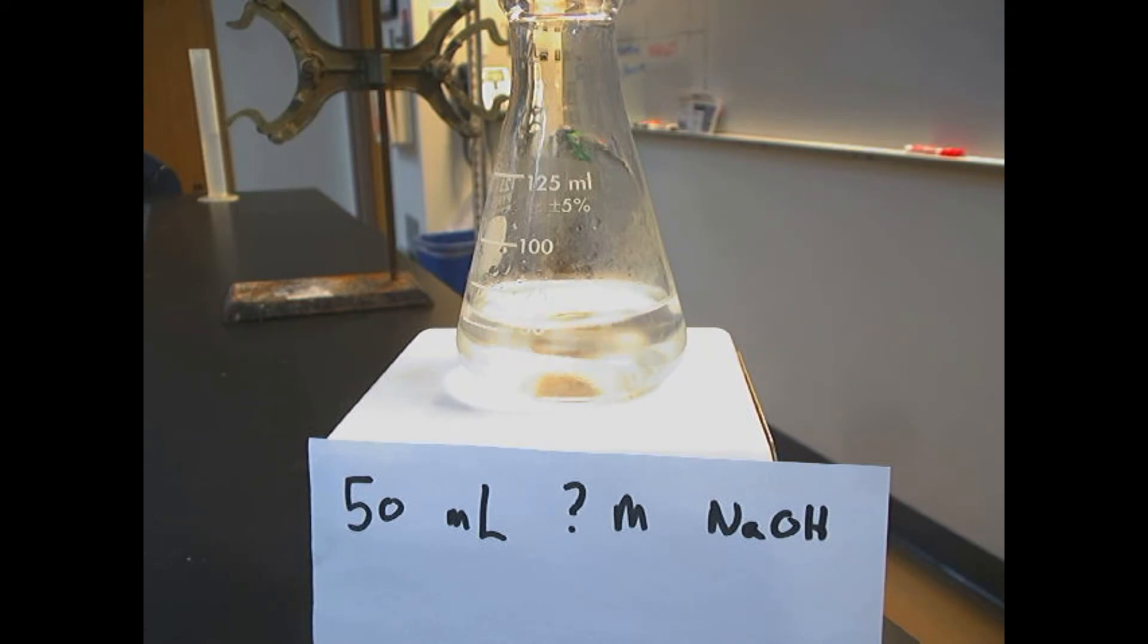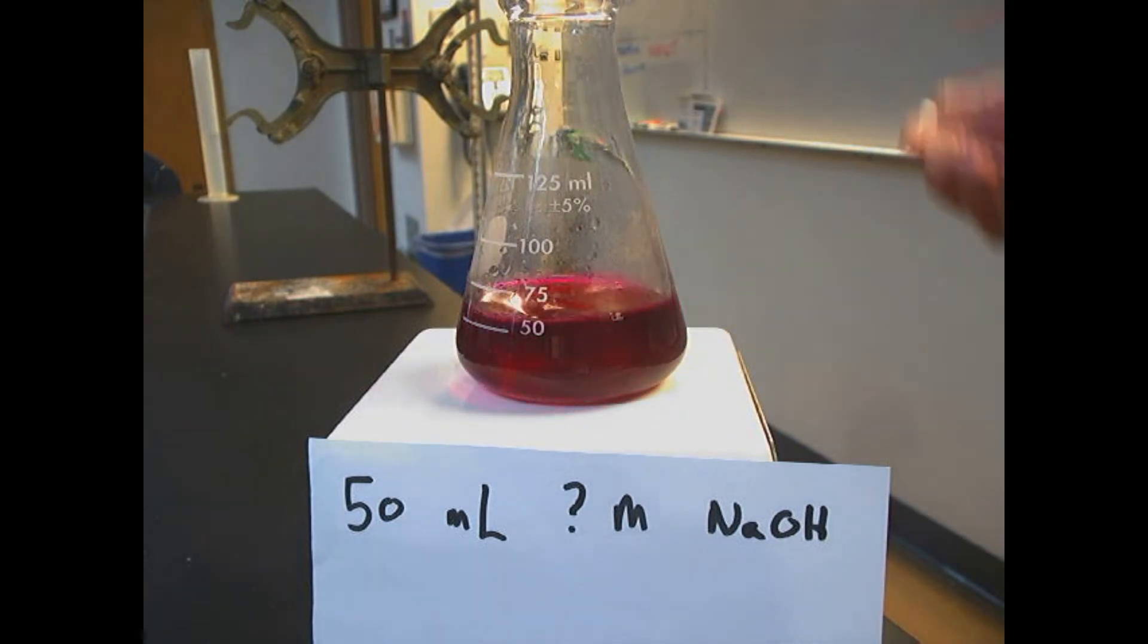We are going to bring this to neutralization. Here's what this means. We're going to add some phenolphthalein to turn it pink. Now that it is a deep, bright pink, we're going to add our acid of known concentration until this just turns back to clear. When that happens, we know we have exactly the same amount of acid in solution as base.